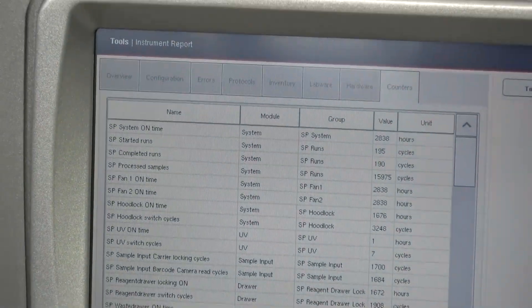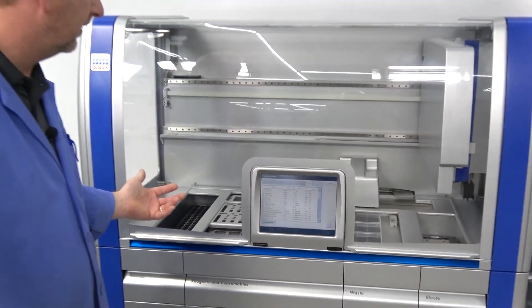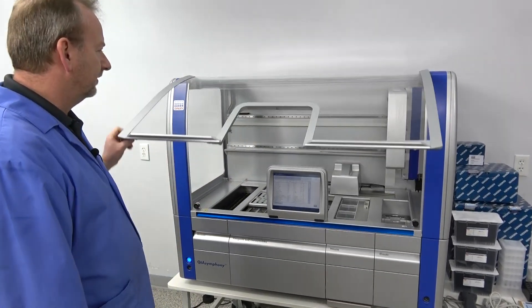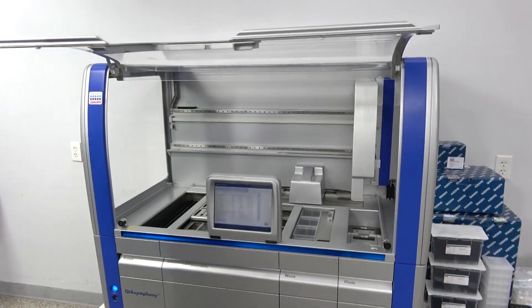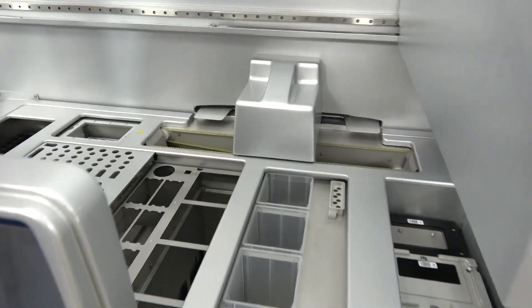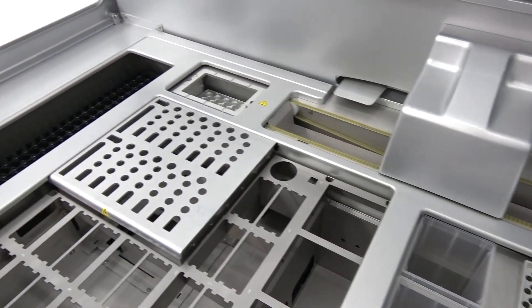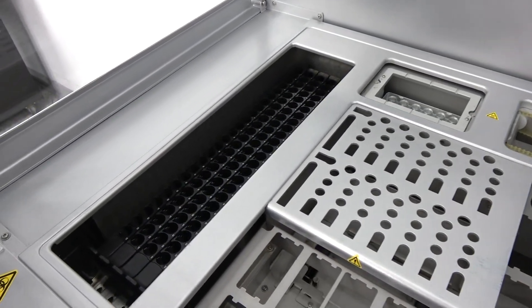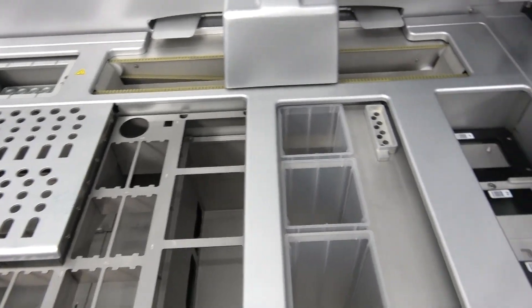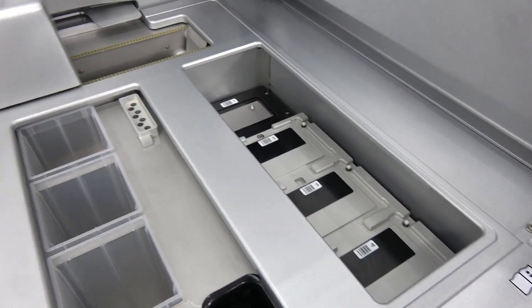It's just a really clean machine that hasn't really seen a whole lot of use. It seems like it's been powered on a lot but not heavily run. We can open up the front door and see how nice and clean it is inside. You can see there's no liquid spillage at all. All we did was wipe it out and disinfect, so I was very impressed with this machine and the functionality of it.